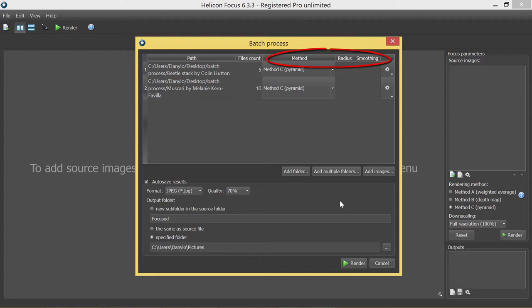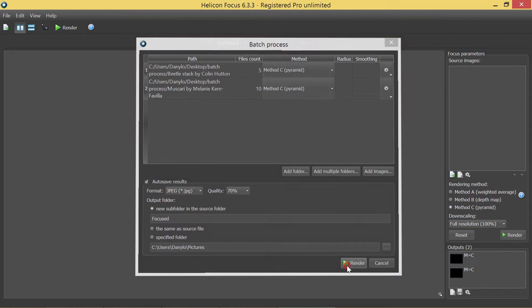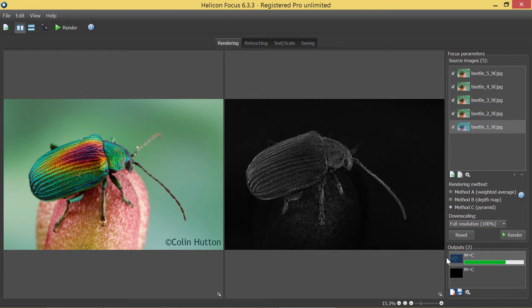All the adjustments having been made, press the render button and wait a bit to see the results.